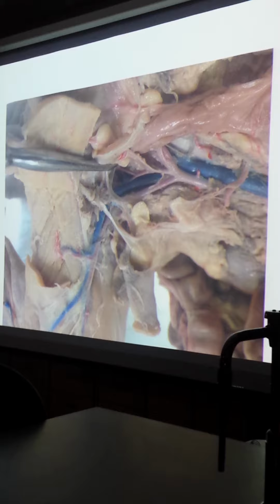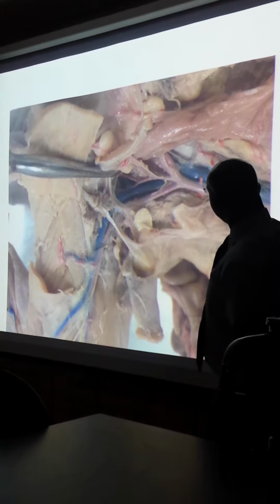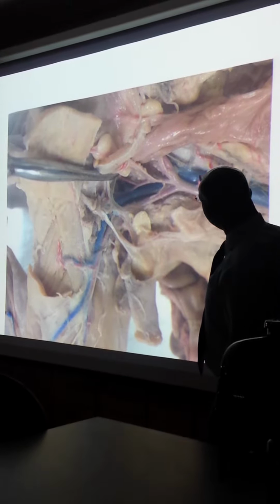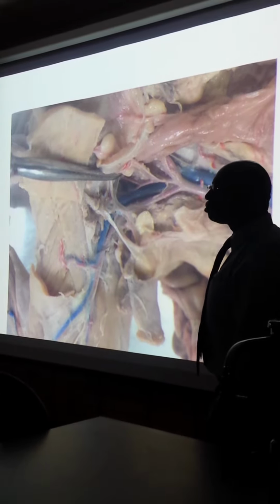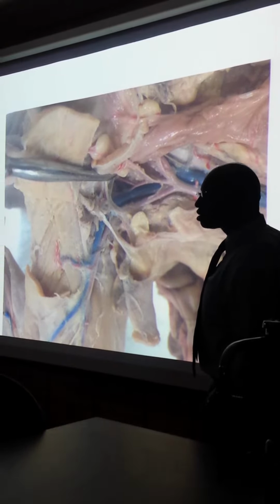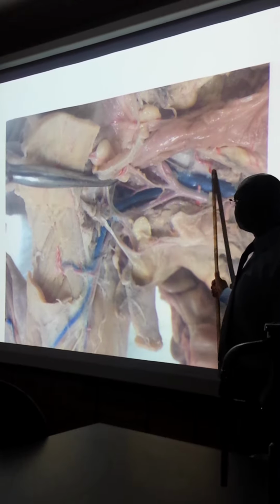This is attempting to show the caudal arteries and veins. Of course, this is that stump of the iliolumbar artery and vein that we cut up. And you can see the vein part of it. Do you see this colorless sort of thing going out of here? The one I was saying is not really well perfused with that blue latex, right? Okay, so that's the iliolumbar artery and vein right here.